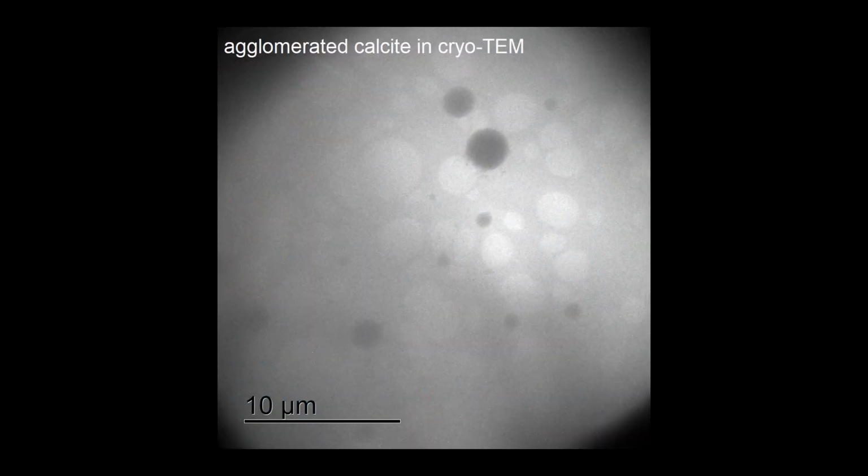With the cryo-electron microscope, you still need to bring the sample into vacuum in a frozen state, basically? Firstly, to freeze it and keep it frozen. And then in vacuum, depending on the temperature, below minus 90 degrees, it will not sublimate this ice. So I have a stable condition, also to do EDX and imaging. By EDX, I can check the composition.